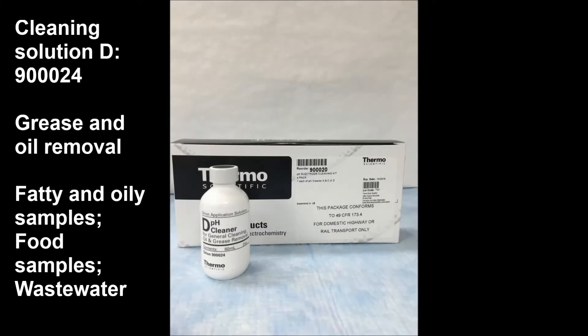Finally, cleaning solution D is intended for grease and oil removal. This may be due to fatty and oily samples, food samples, or even wastewater effluents.